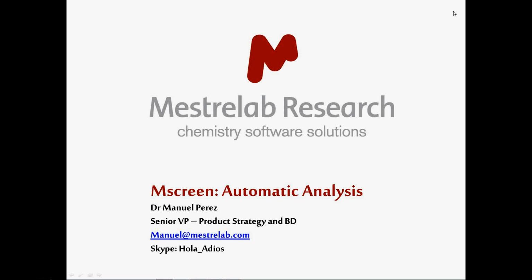So this is the reason why I wanted to make this bit of introduction, why I'm going to be mentioning certain aspects that maybe you wouldn't think would be on a practical session, but I thought it would be required in order to avoid problems for you later on when you come to the point of wanting to automate your analysis, because you don't want to spend hundreds of hours in front of the computer screen looking at NMR peaks, but you would like to make that process as painless as possible.